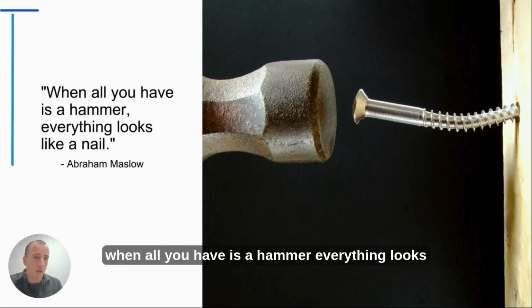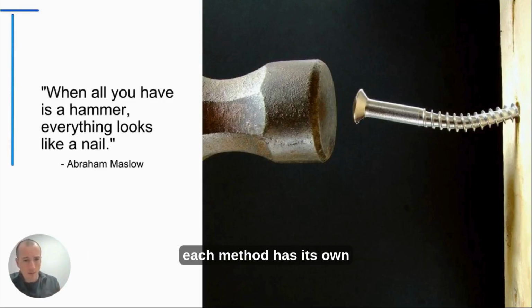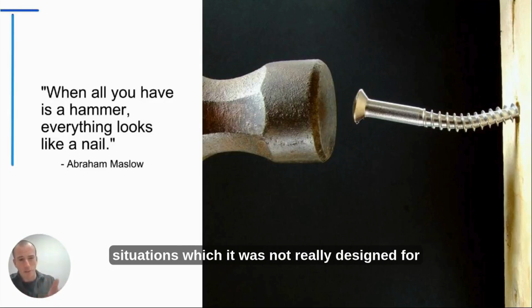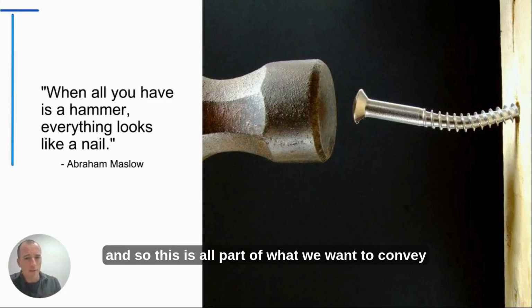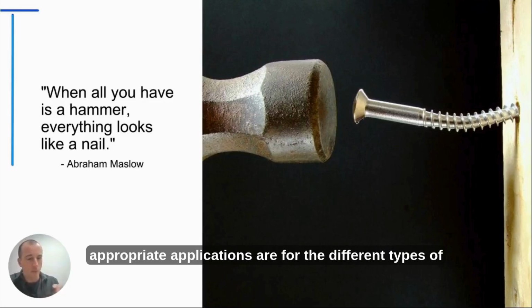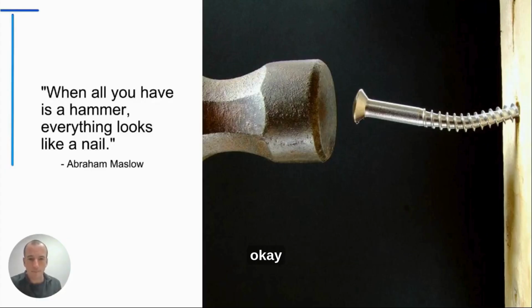So the quote is, when all you have is a hammer, everything looks like a nail. When we only have one thermal conductivity method, each method has its own certain orientation or bias. You can get into some problems in applying it in situations for which it was not really designed. And so this is all part of what we want to convey in the presentation: educating on what the appropriate applications are for the different types of test methods in thermal conductivity.